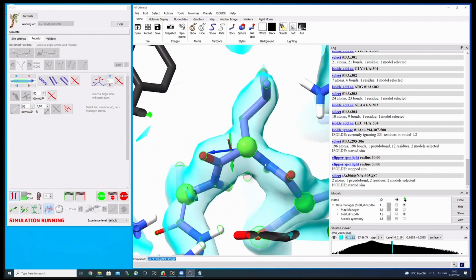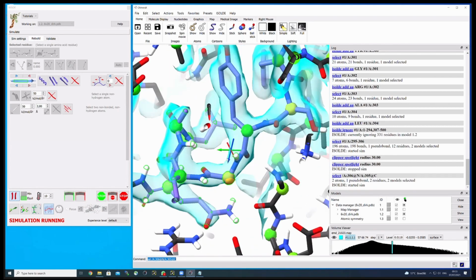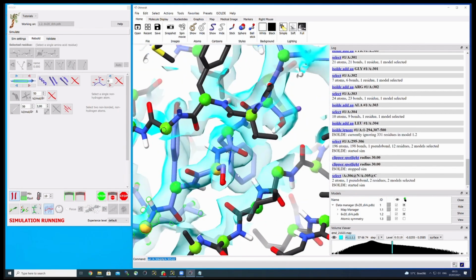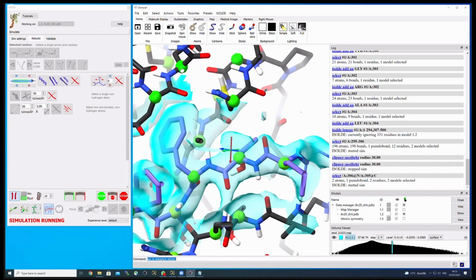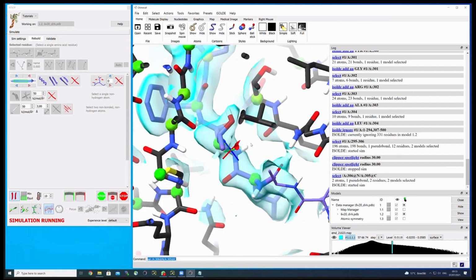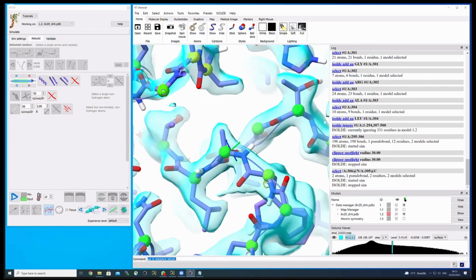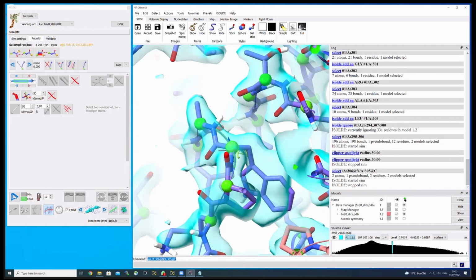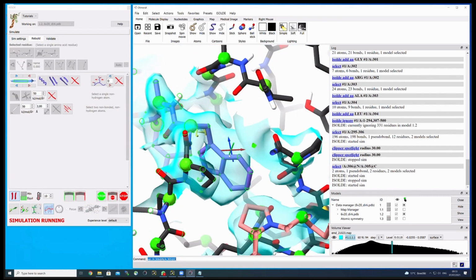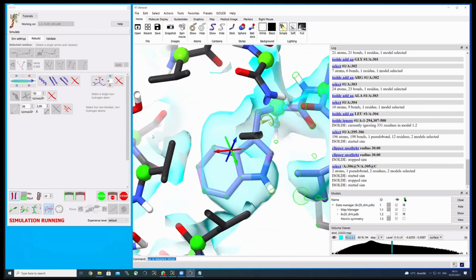Once you have done this, maybe we can do a little checkup on the sequence that we just built by going through it. We can discuss maybe some sidechain orientations, but essentially you have achieved the task, and I will briefly reiterate what we can do with this tryptophan here. This is not in its right position. I think this is obvious.